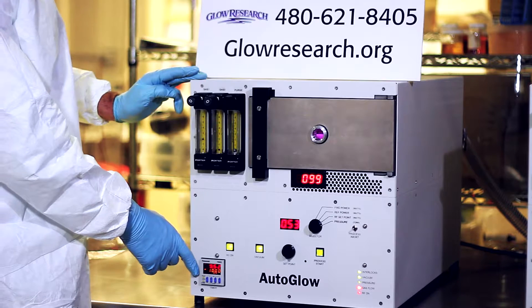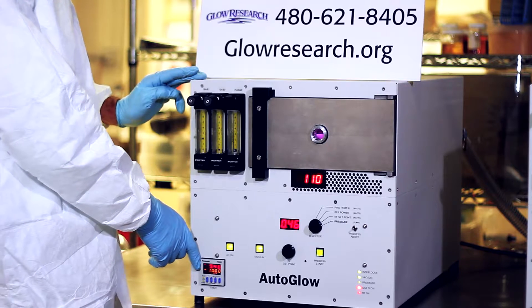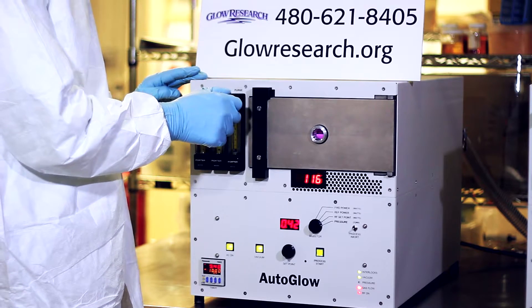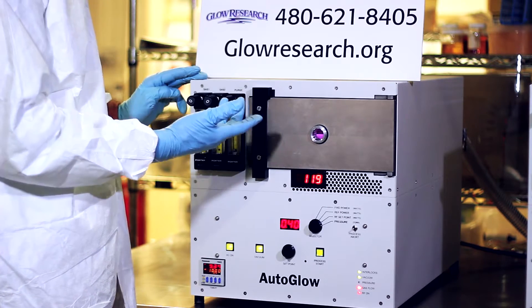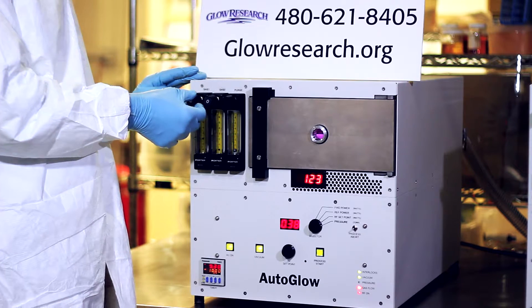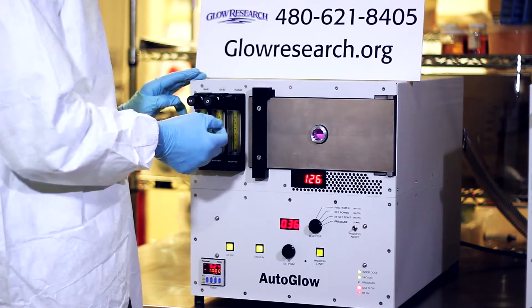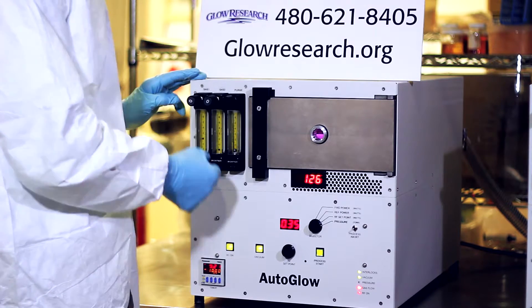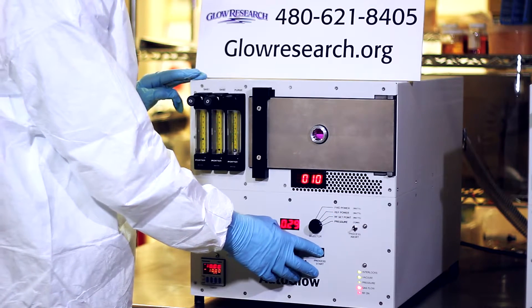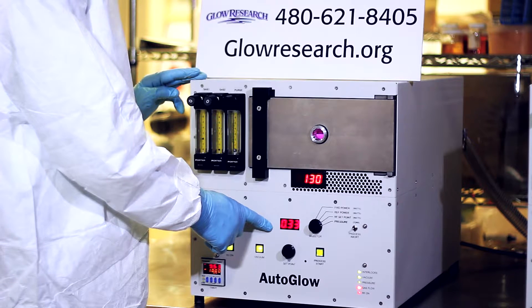A Pirani gauge is used for accurate chamber pressure readings. Process time is set on the timer and the system will automatically stop at a preset time. The entire system is specifically coated for RF containment. Metal screws in the cabinet are spaced at close intervals for RF integrity. Adjustable nitrogen purge allows for soft venting of the chamber after the process has been completed. The system is modular and has LED diagnostic indicators to confirm sub-module functions and process steps. The Autoglow is CE tested and marked to meet international safety standards.